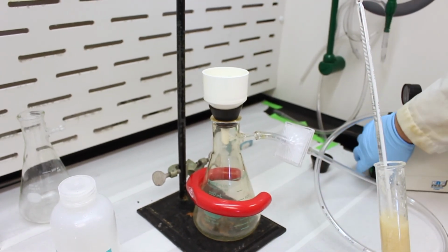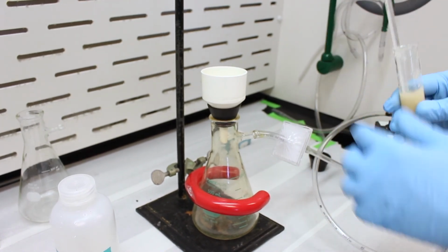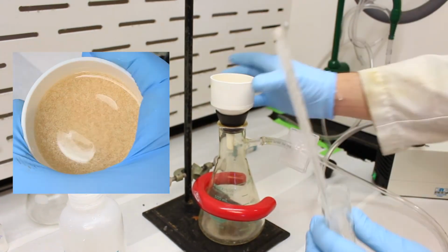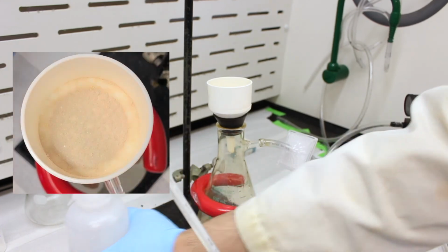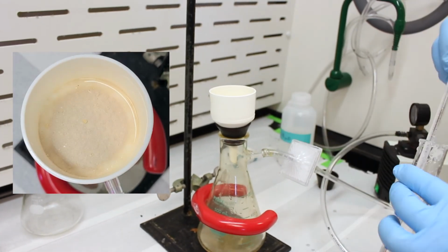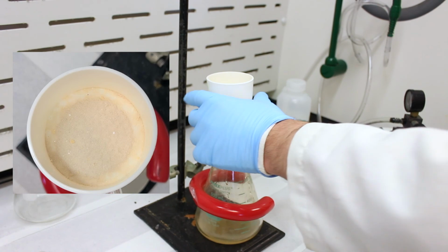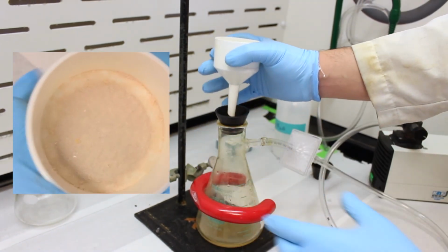So let's turn on the vacuum and dump in the crystals. So turn that on. Try to agitate this. So I'll add a bit more water to try to rinse out this residue in here. So it's reasonably dry now. So this isn't the final filtration. This still has to be filtered.